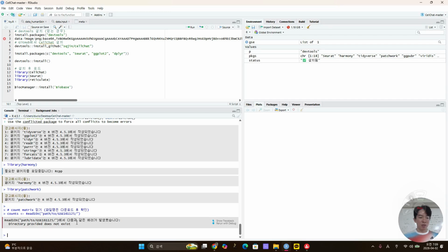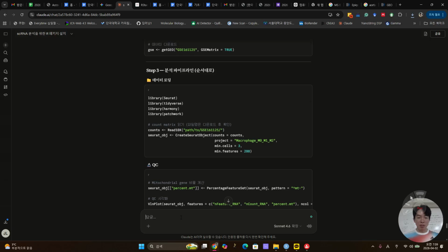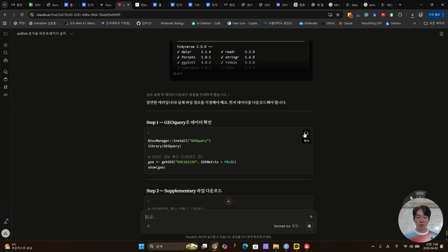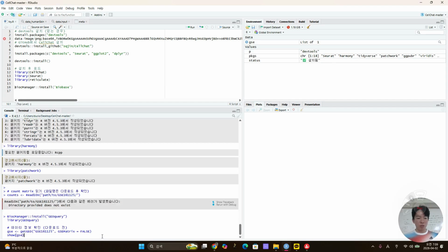There is some error. Okay, so let's see. If we have trouble, maybe there's an error here. Copy and paste here, and then they analyze what the error is. Oh, okay. They are showing some error. So let's see.